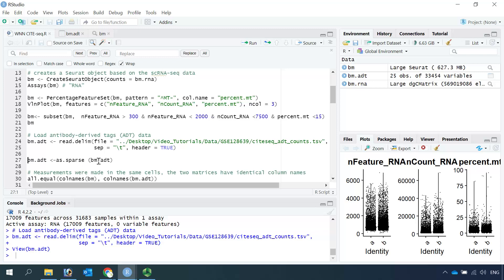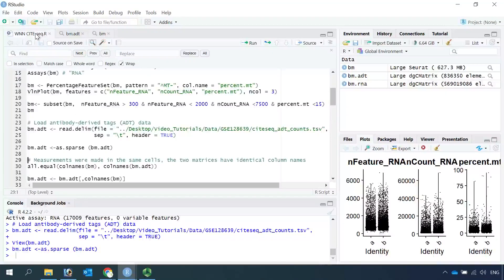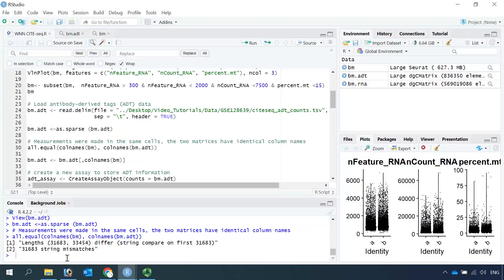First let's convert the ADT data into matrix data. You can see we changed the ADT into a large DGC matrix. Now we can compare the cells in the RNA dataset with the cells in the ADT dataset. We know they are not equal because we performed quality control on the RNA dataset — the column names are the cells. If we run this code, you can see the lengths are different: RNA has 31,000 cells and ADT has more than 33,000 cells. So let's subset the ADT data and only keep the cells that are in the RNA-seq dataset.